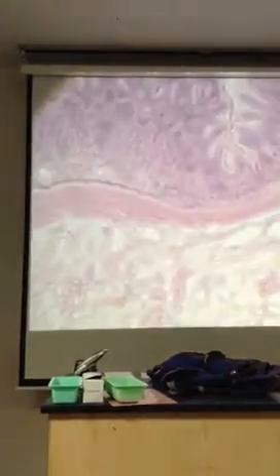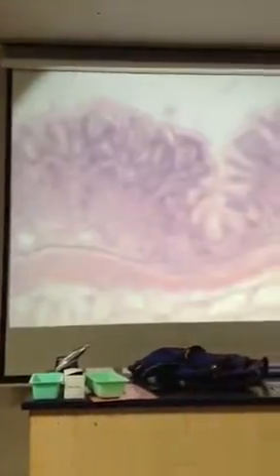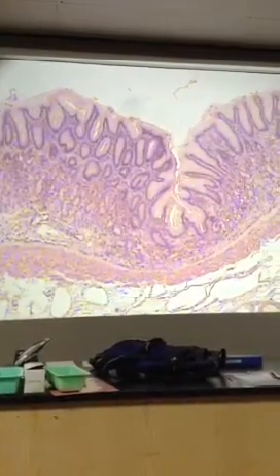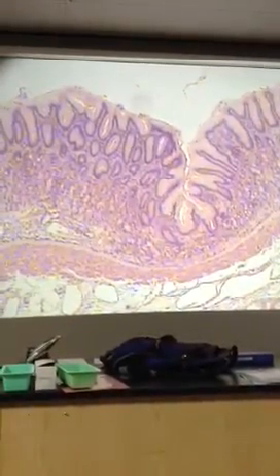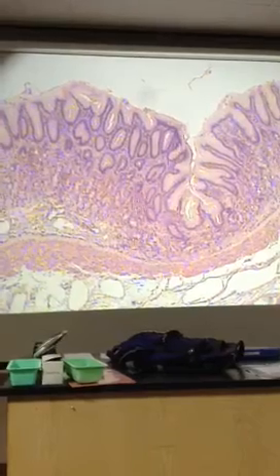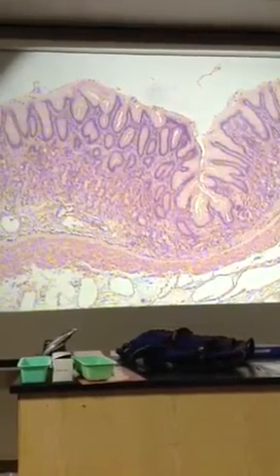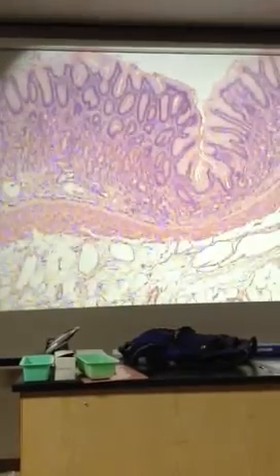All right, so then we want to zoom in on right here, the gastric pit, and give you a little more information about that. Okay, so I said you didn't have to do the parietal cells and chief cells, but I did want you to note where the gastric gland is.